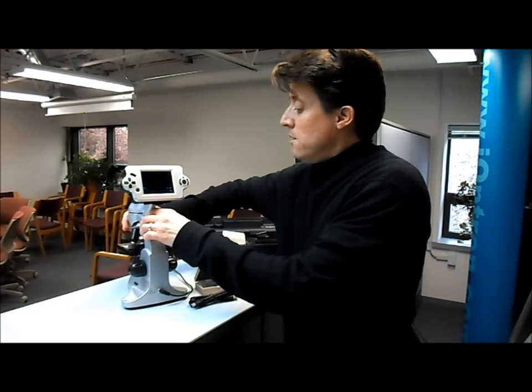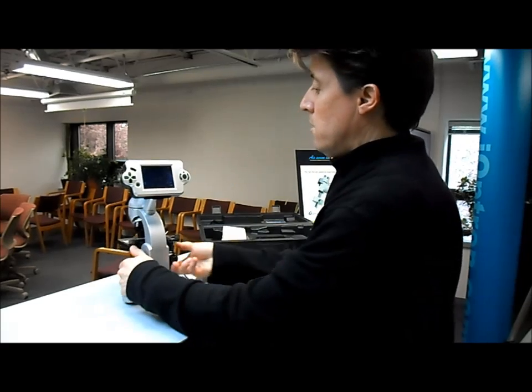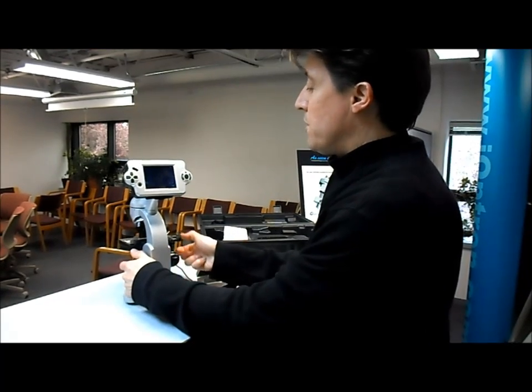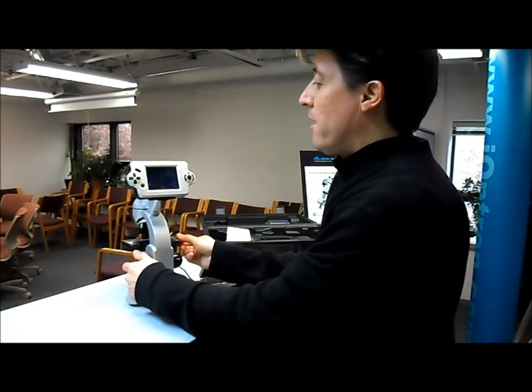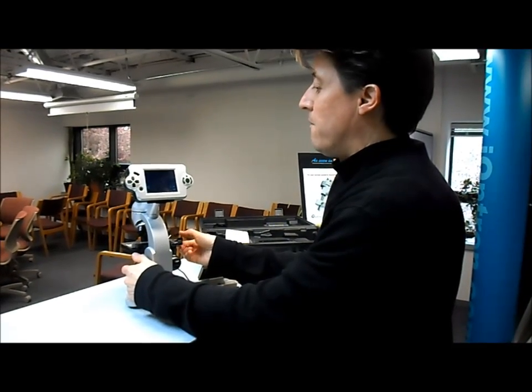I can increase the magnification one more time to a 40x, use the focus, and I can move this around. It's just really neat to see the inside of the cell.